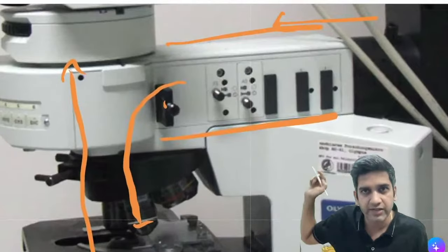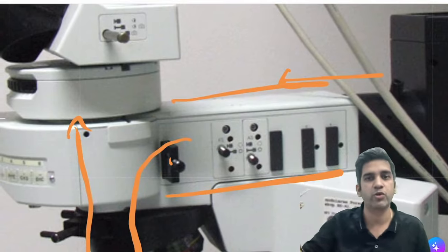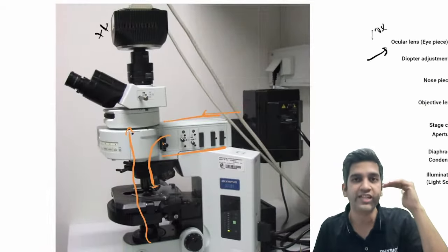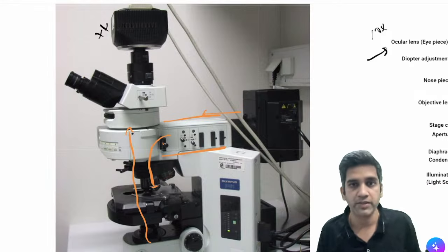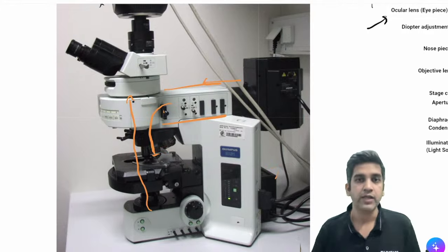If you look carefully, these are filters. I can say red light filter, blue light filter, yellow light filter, based on the fluorescent microscopy we use, right? The light source from the top is one of the significant differences between fluorescent microscopy and light microscopy. You have to remember that. And also it has a chamber which can produce lights here, right? Okay, that's a big difference.